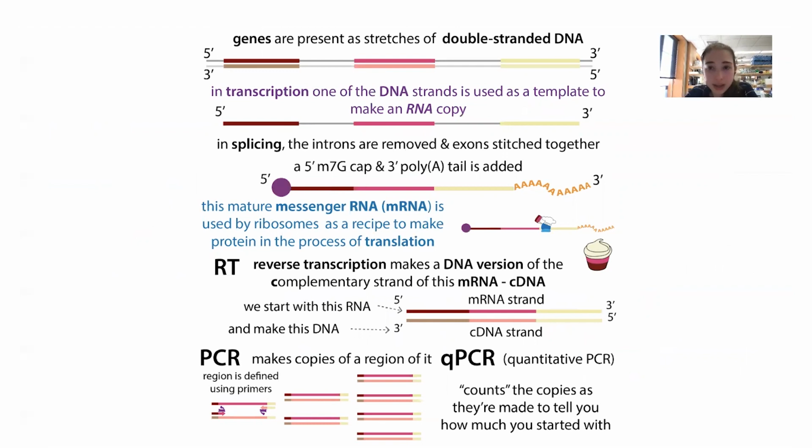Some sequences might be preferentially copied, others might get lost in the process of your preparation. With the northern blot, you don't have to worry about it being copied, you just have to worry about it being present. And then you don't have the bias that comes from the PCR technique and the reverse transcription technique.